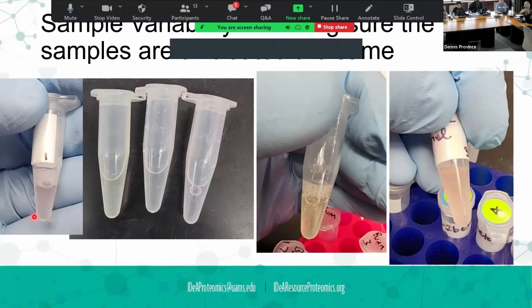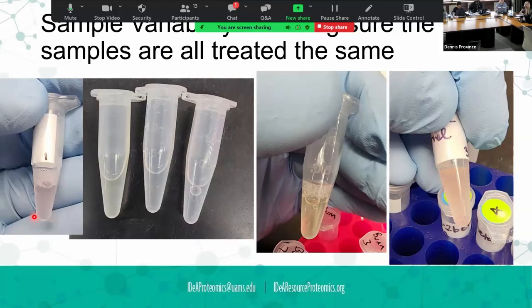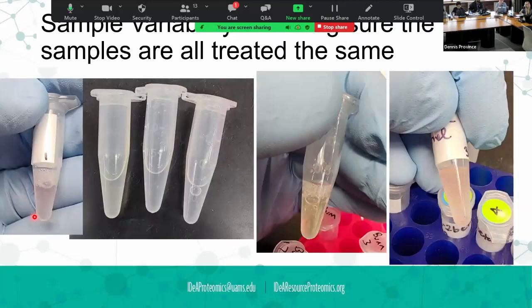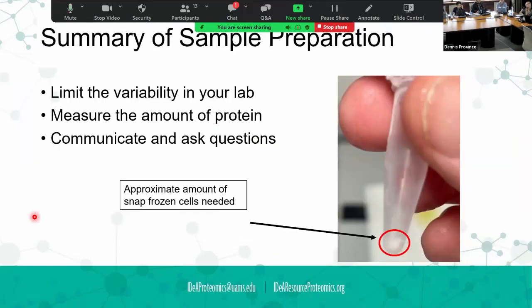So the more that you can minimize that and press upon your staff and the people that you work with about that, the better. And also take a note of it, because when we see the analysis and we see a PCA plot and one sample is looking a little bit different, we have a reason for why it's separated out. So it helps with interpretation. It may not necessarily get thrown out of the analysis, because you want that variability kind of within your experiment. So there's different things that we're going to look at for QC. All of those pictures were taken and put into the file so that, 4 to 6 weeks later, when we're doing the bioinformatics, we can say, there's a lot of variability here. And then we look back and there's a note from sample prep that said, yeah, it looks like they had some issues here with some variability of the samples.